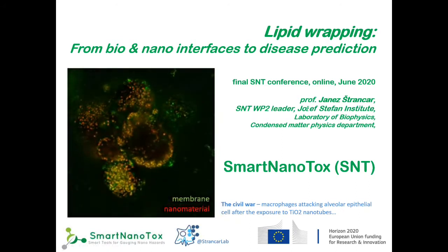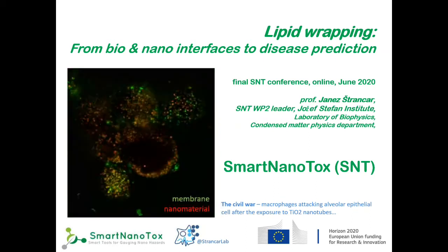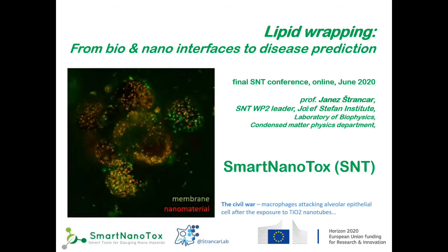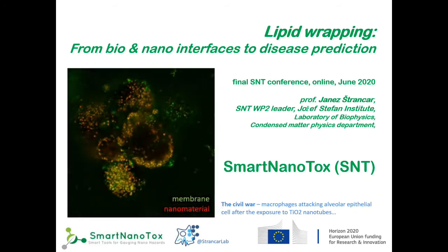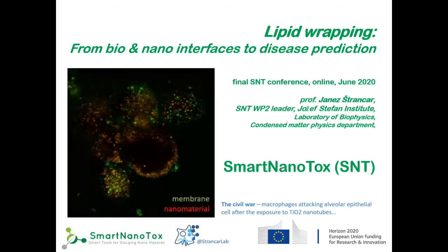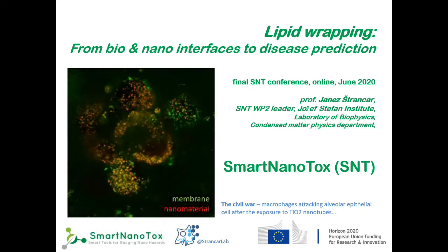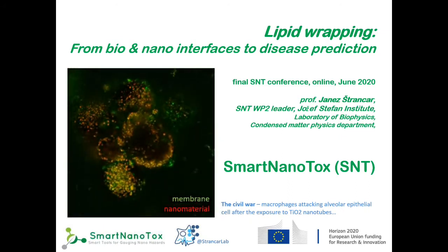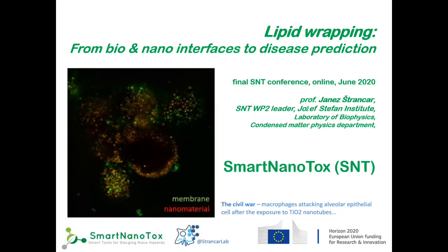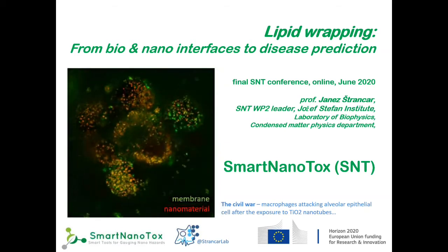In this time-lapse movie, shown over a few hours, you can see an attack of several macrophages on the epithelial cell. But you can also see many more details. You can see a lot of material moving as a whole, as a large assembly, as a large aggregate, despite seeming to be composed of many particles.